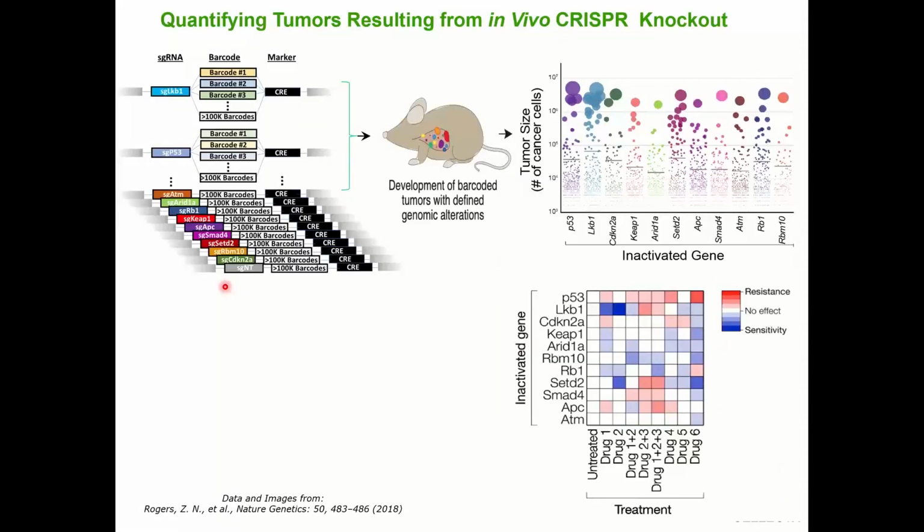It's also possible to add sgRNA into the mix too, and look at how different subpopulations respond or are created when certain genetic changes are purposely introduced. This is related to the perturb-seq, crop-seq, CRISPR-seq type methods that you may have heard of. If you're familiar with these approaches, then you can see that by linking the sgRNA that will induce specific changes into a cell population, and linking that with the barcodes in the cell, you're able to then correlate specific changes with certain changes in the expression level of those cells.